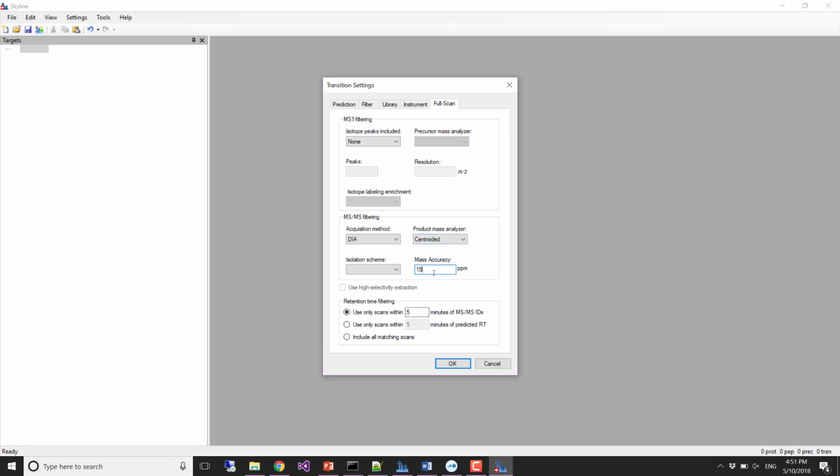So we're going to stay with centroided extraction. What I also found in Navarro was that extraction from centroided data works quite well. 10 is a pretty good default. It works on a lot of Q-exactive data, but apparently we need a little bit wider on this data.